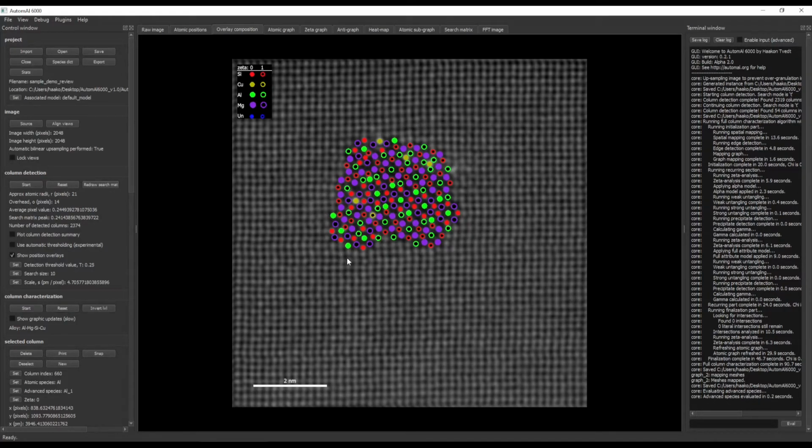And the other intended use case, which is something I have not been working with, is that you can export the raw data with positions and species. You can select many different attributes to append to that data, and it will make a CSV file of it.